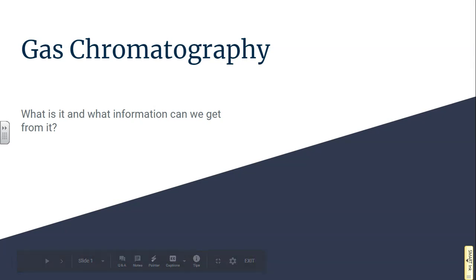Everybody, I just wanted to take a little bit of time and give you maybe the nickel tour of gas chromatography. This is not designed to be an in-depth look at how gas chromatography works, but more like a primer in what kind of information you can get from it if you were, let's say, in a lab class. So let's talk a little bit about gas chromatography, or what we call in the business GC.